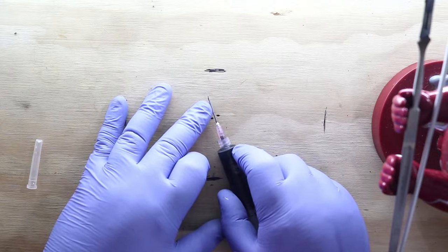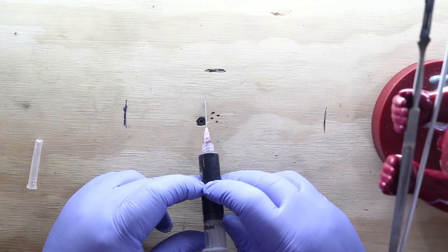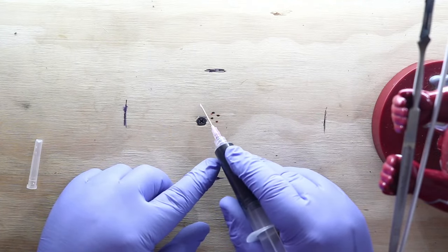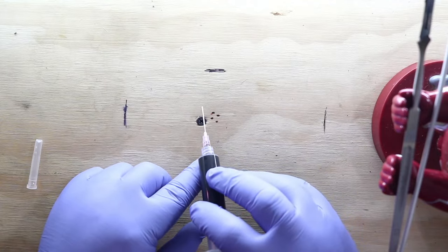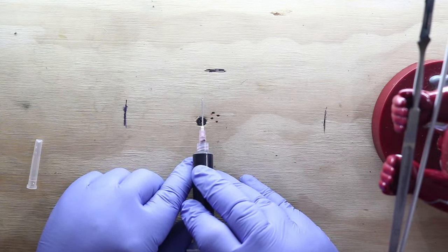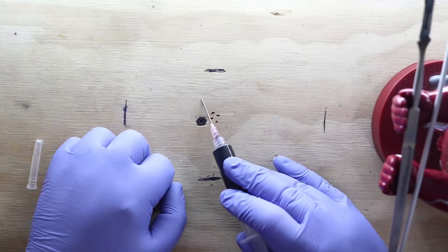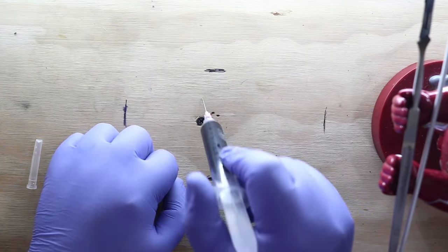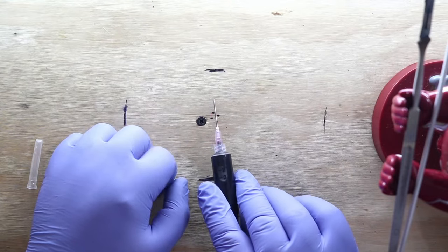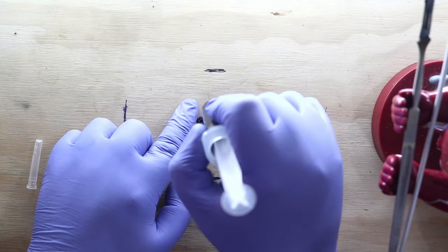What we wanted to do is turn this into a coring device. What you're going to do is take that hole, face it and angle it to where it's flush with the bottom. There, I've curved the needle at the tip, actually. But what you're going to do is take that in, and instead of doing a stab, you're going to do a smush. You smush that flat piece all the way down to the bottom of the dish. And then what I do is a twist and a turn like that, and then lever up to pull my biopsy out. Was that clear, Samantha? I think so. Okay. So here's the flat. I'm going to try to do it sideways. There's a smush, and then a twist, and a lever up, and a pull out.